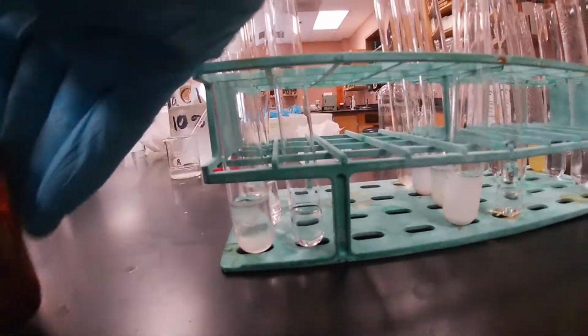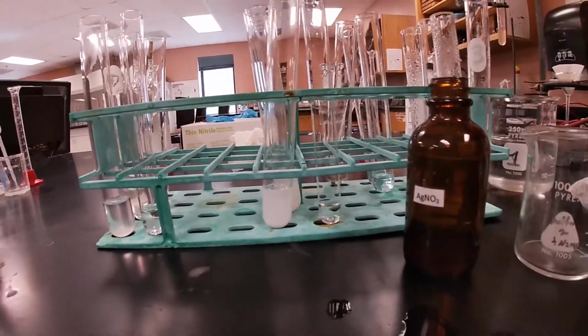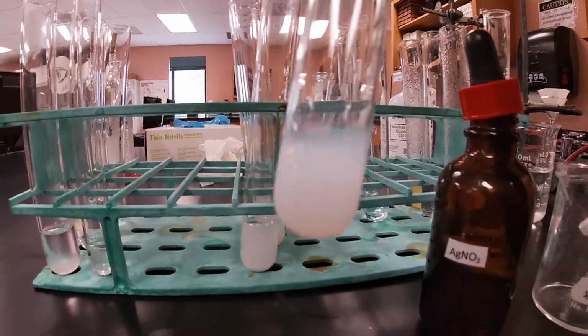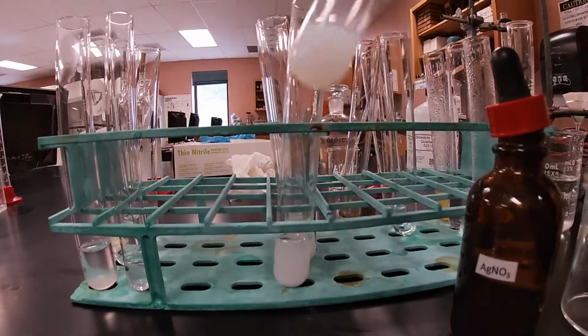So then let's go to the other one. Let's go to our silver nitrate solution now, and add our drops. Ooh, nice. Nice precipitate formation right there. It seems like there's a lot, actually.